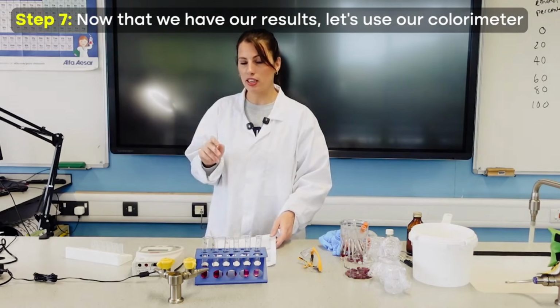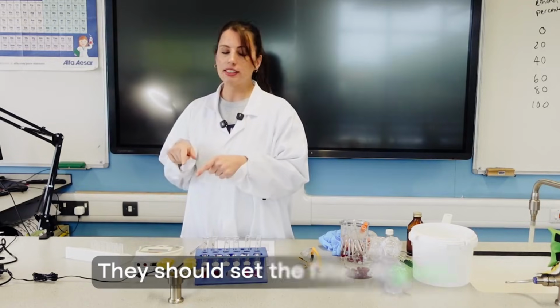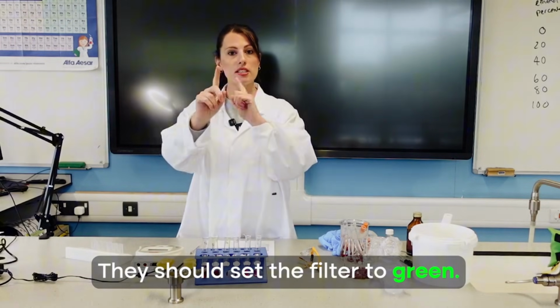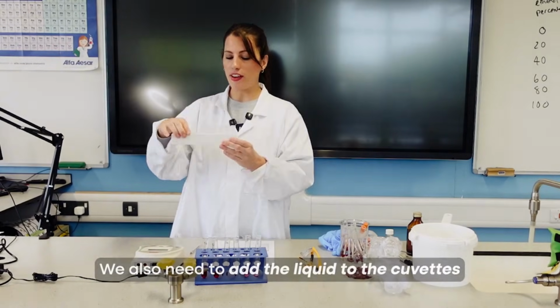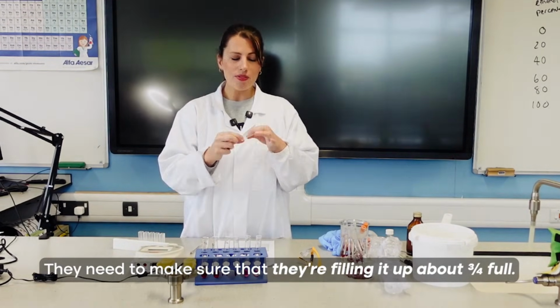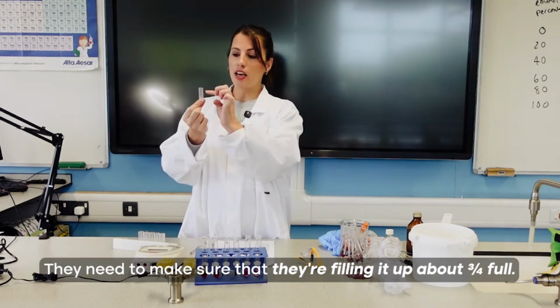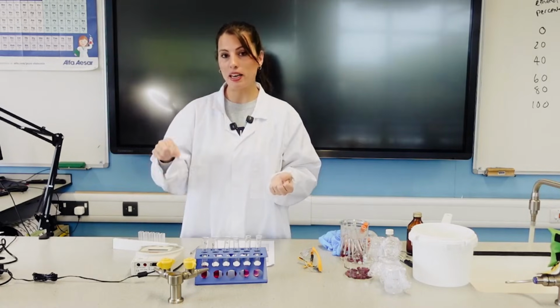And a few things about the colorimeter to start with. Students, because we're using red liquid, they should set the filter to green because you want the opposite color on the color wheel. We also need to add the liquid to the cuvettes, and with the cuvettes, they need to make sure that they're filling it up about 3/4 full, so that it's full enough that the light will be shining through the liquid, but it's not so full that they could spill it into the colorimeter.